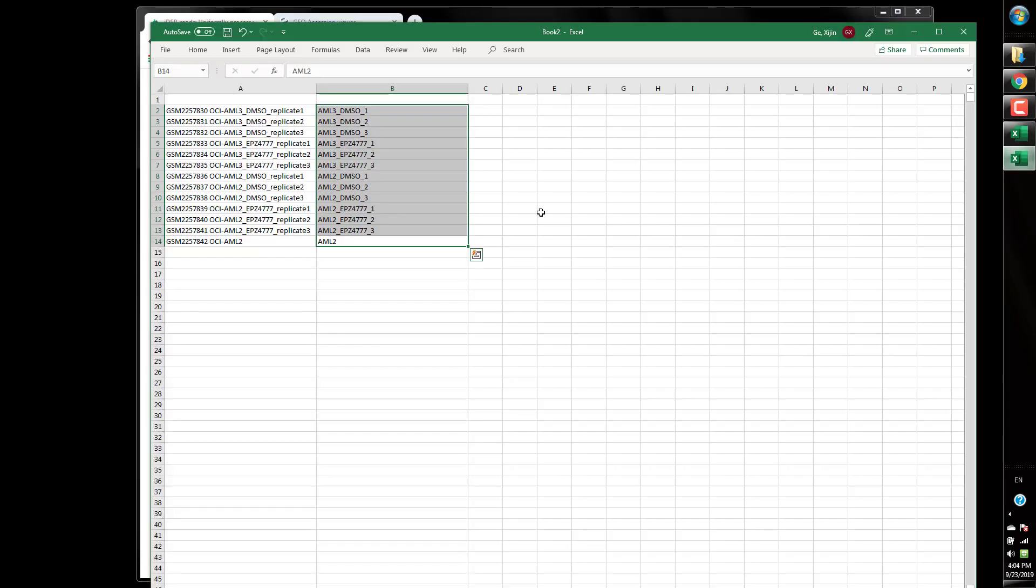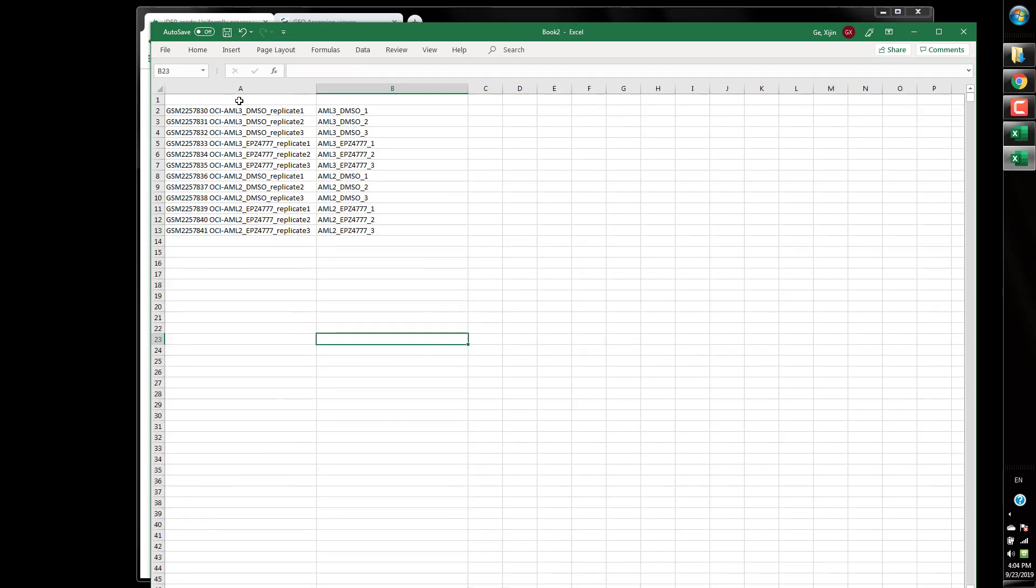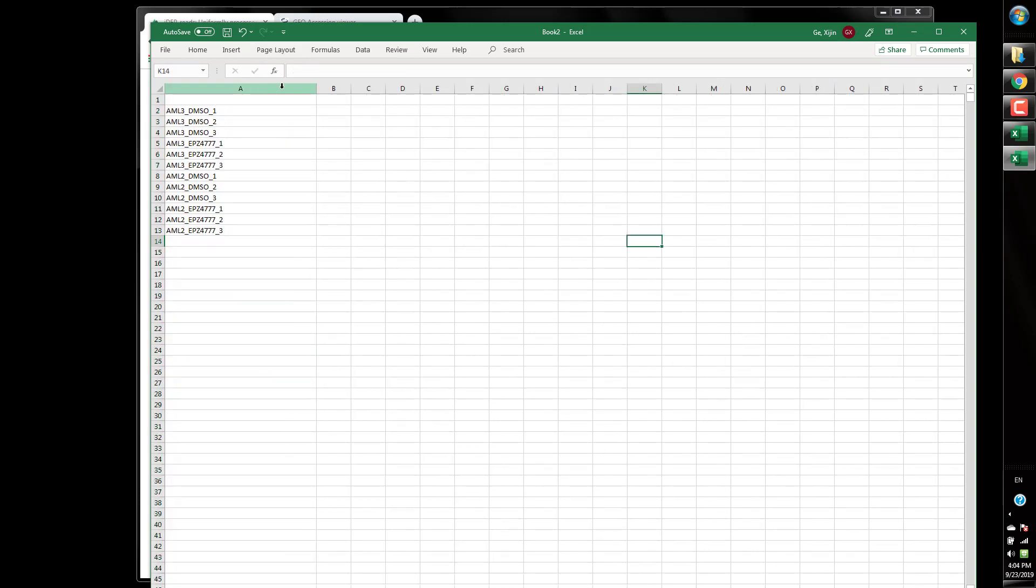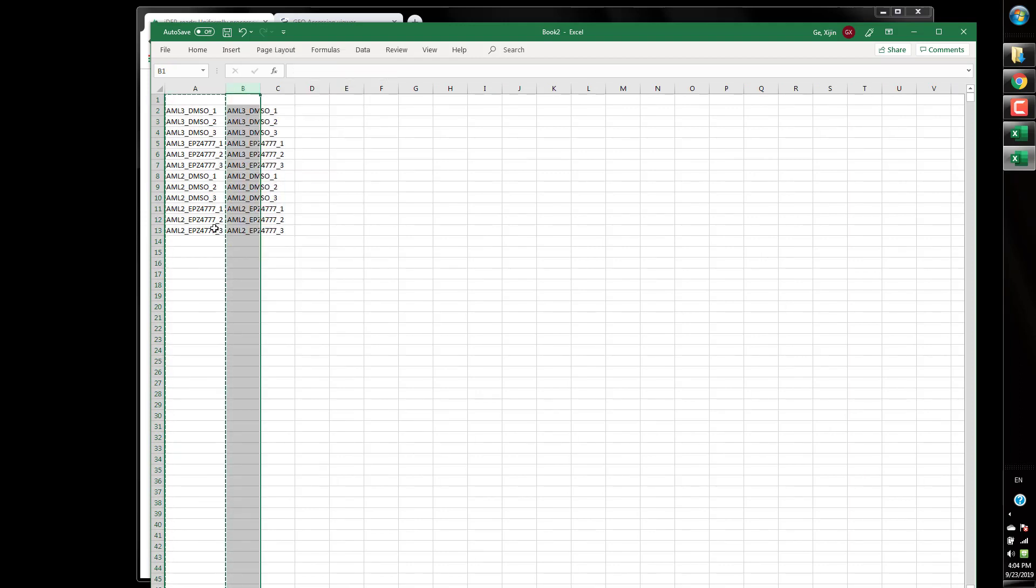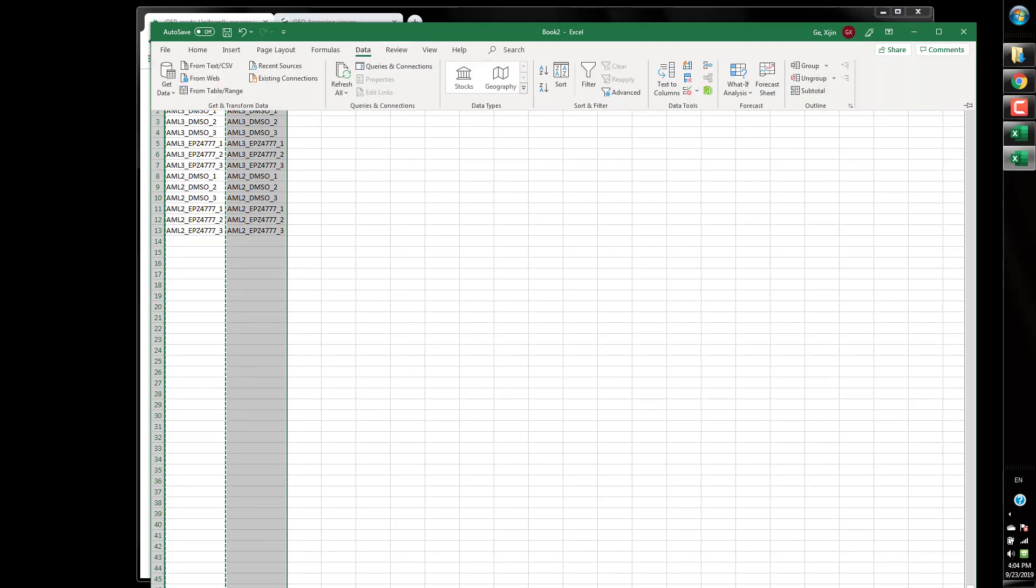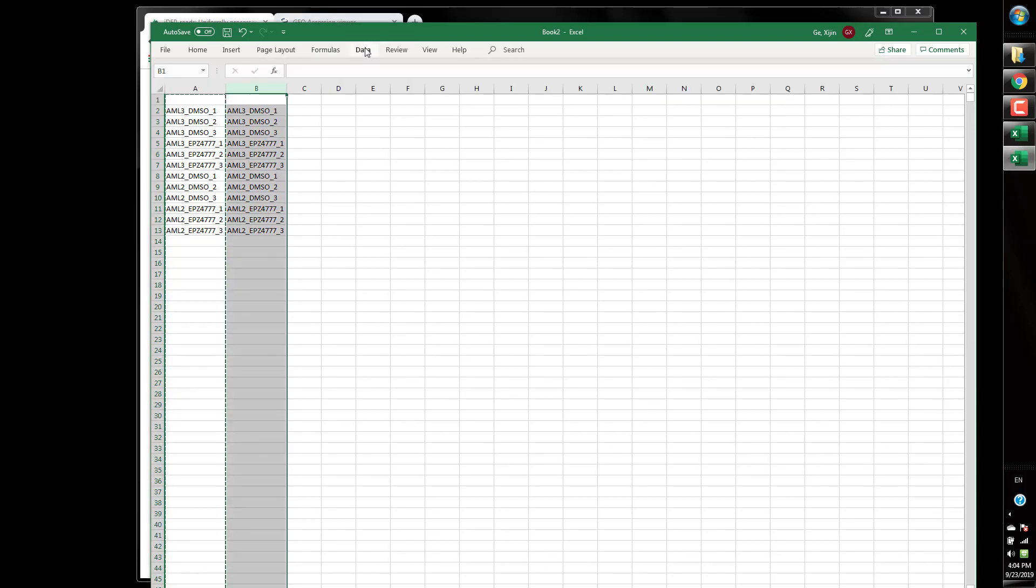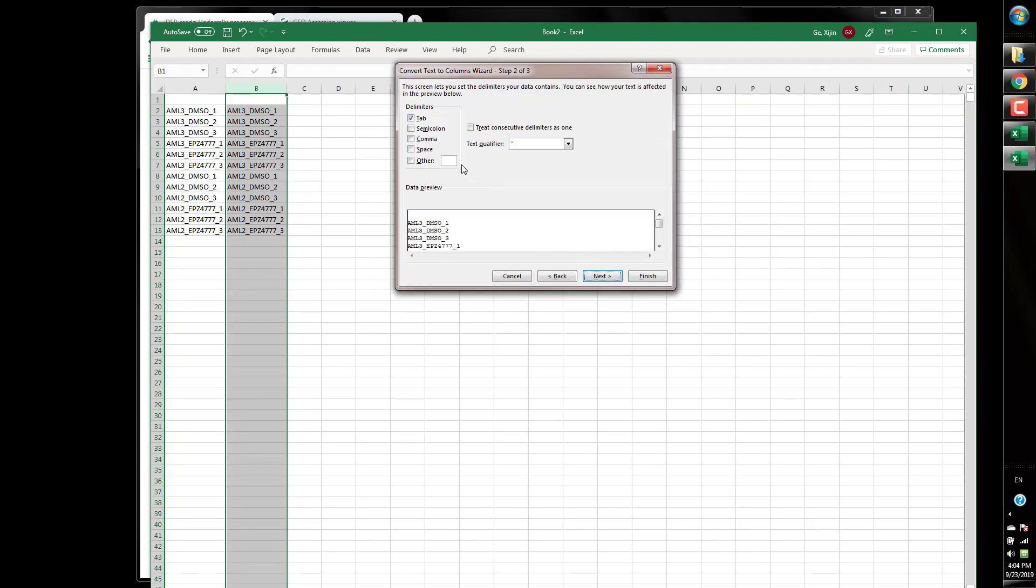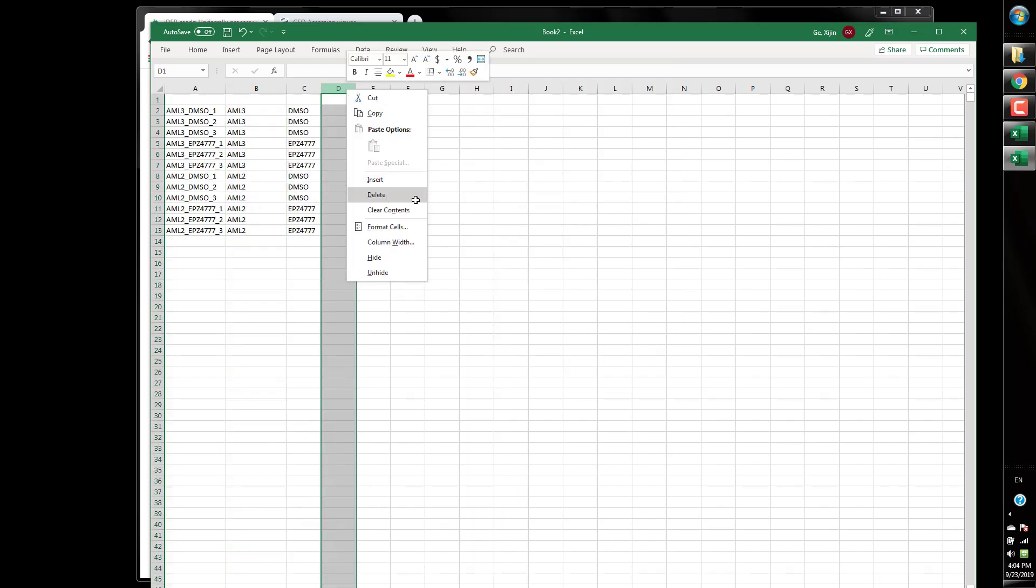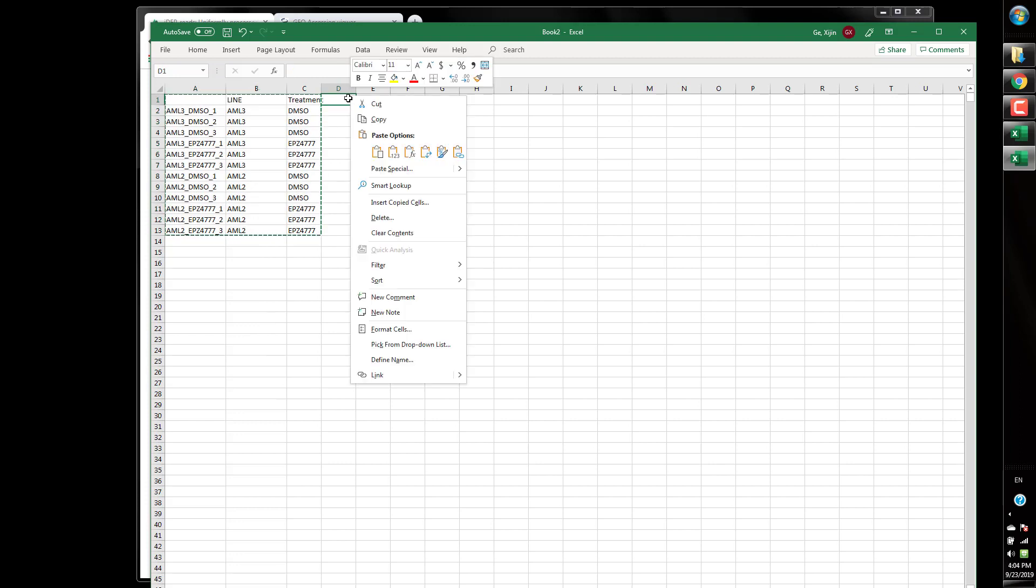And come back and start making an experiment design file so there are many ways to do that but the quick way is probably using this text to column function here just delimited and underscore and finish. So delete that and this is obviously cell line one factor and the treatment was our second factor and we need to transpose it back.